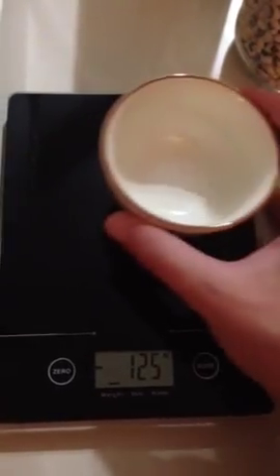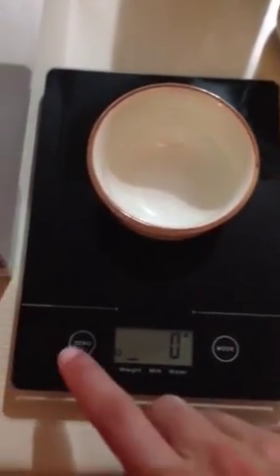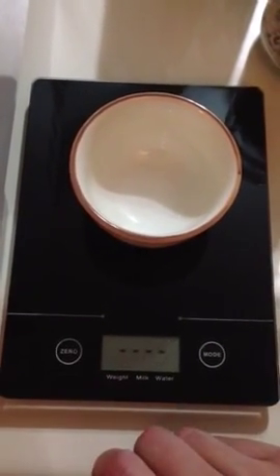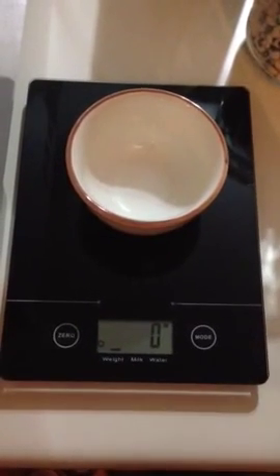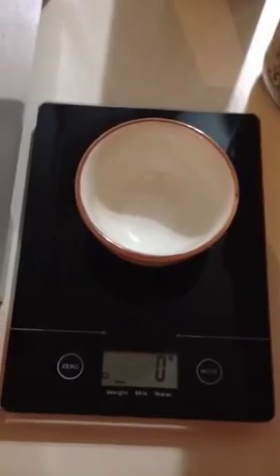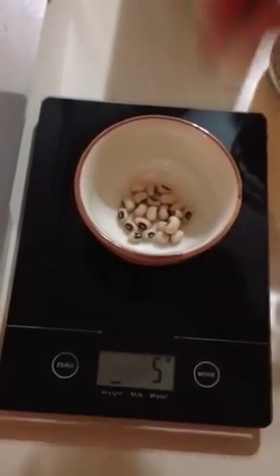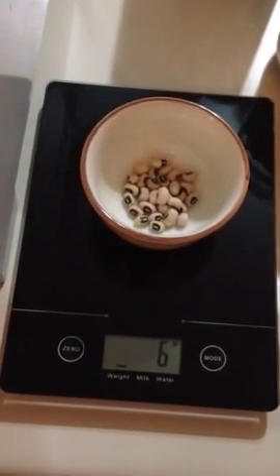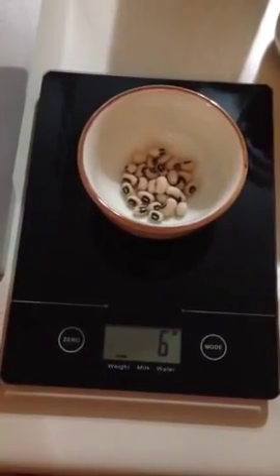So, being that I'm using a small object, I'm going to use a small cup and hit the 0 button to make sure that this scale is considering there to be nothing in the cup. This cup is just to contain the beans as I measure them. So I'm going to take a small handful and weigh out some of these black-eyed peas. And you can see this scale is only showing me one significant figure. It's telling me 6 grams. So I'm going to write that on my data sheet. I'm going to write 6 grams.